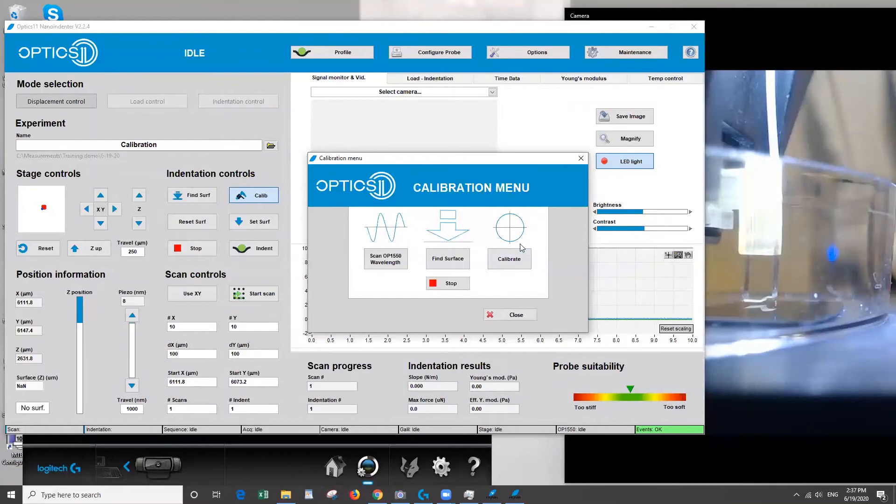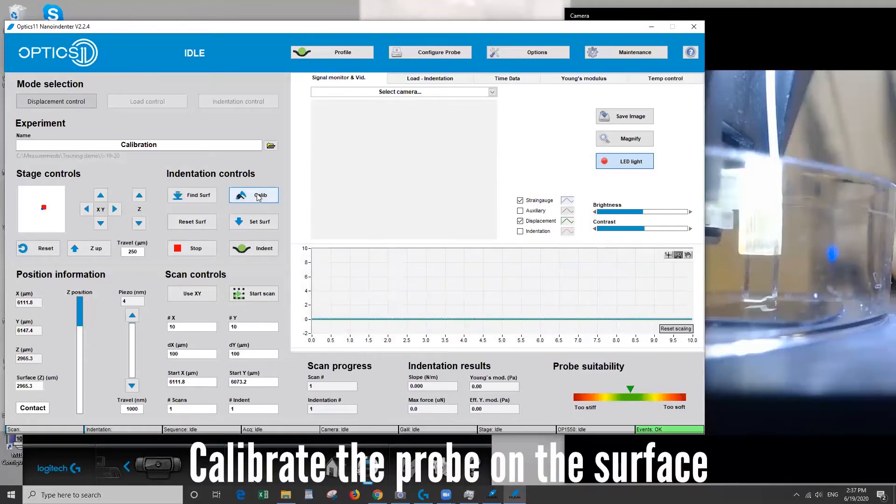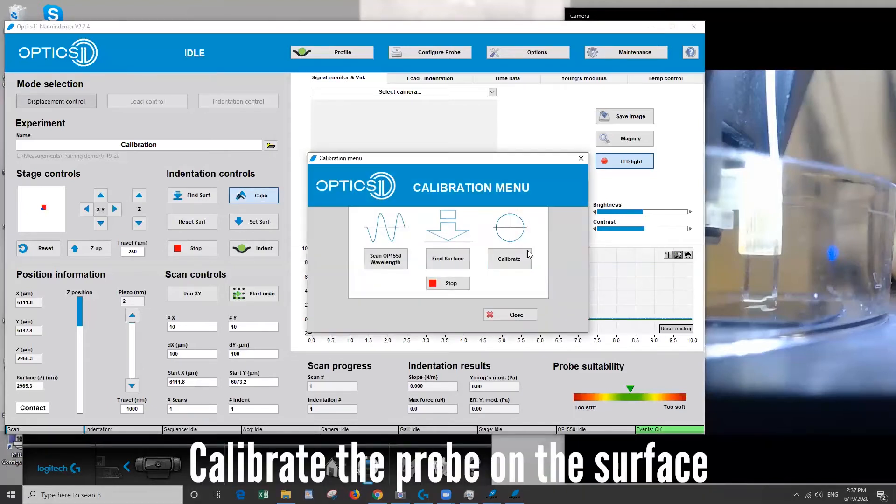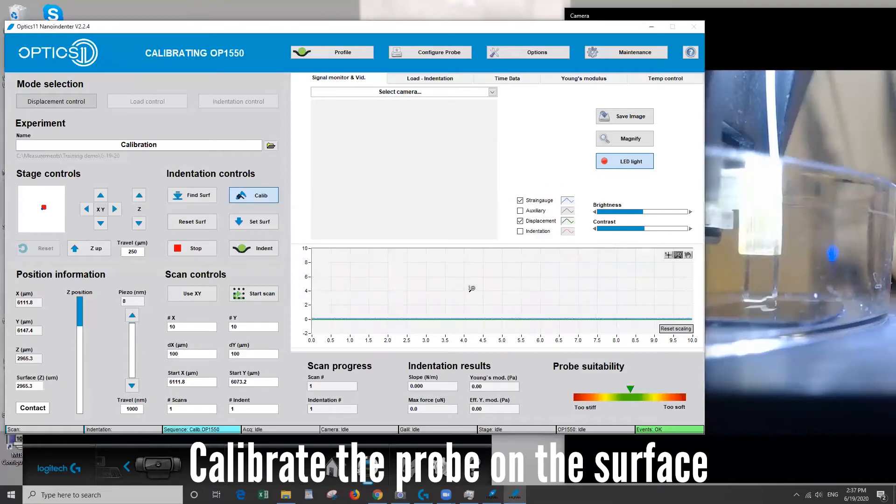All right so once it's finished you'll hear the beeping stop and it'll also show you the steps have quit moving here. So now we can click calibrate make sure it's in contact with a stiff surface. So silicon is an infinitely stiff surface compared to the bending of our cantilever so that's perfectly fine.